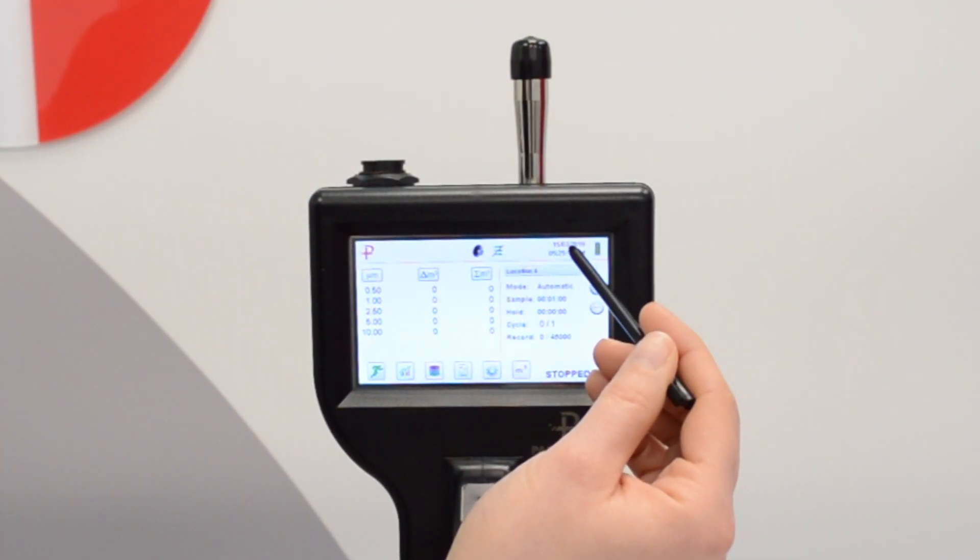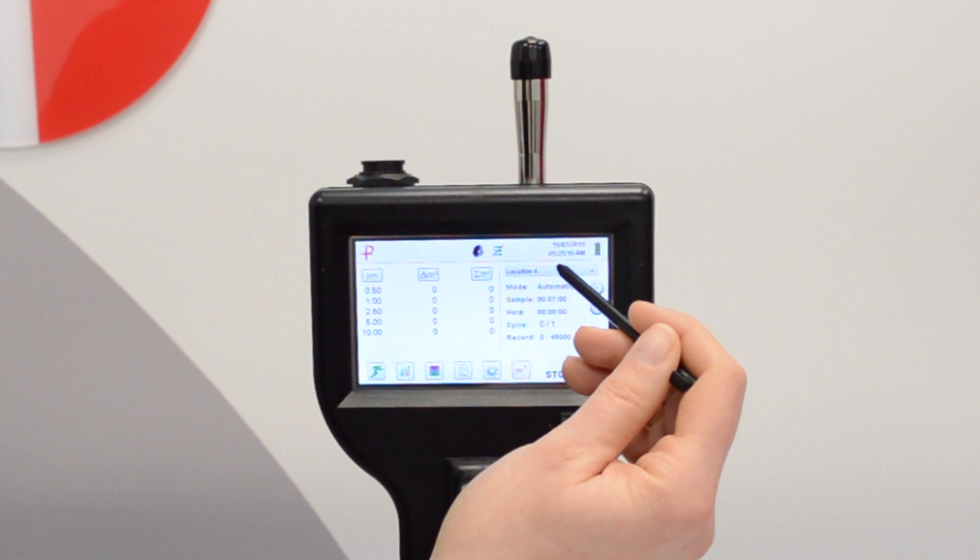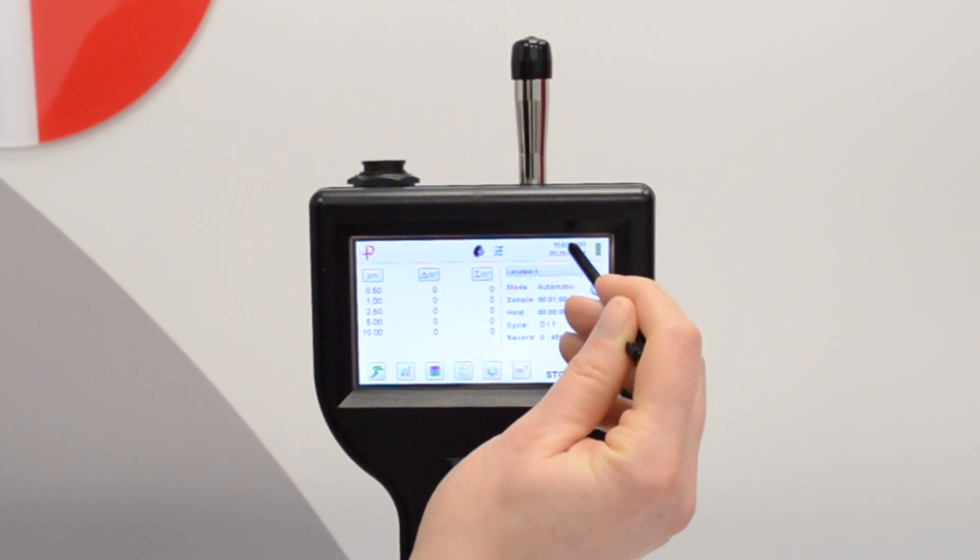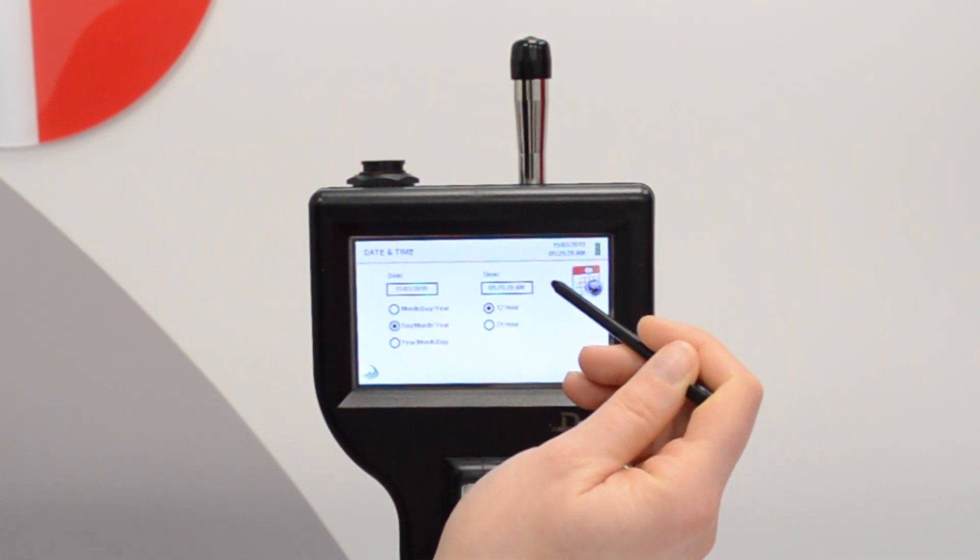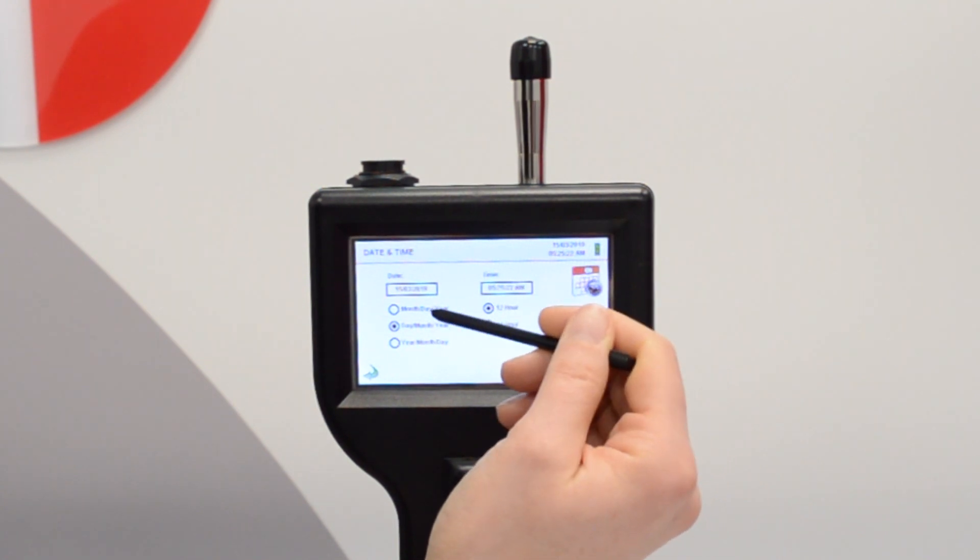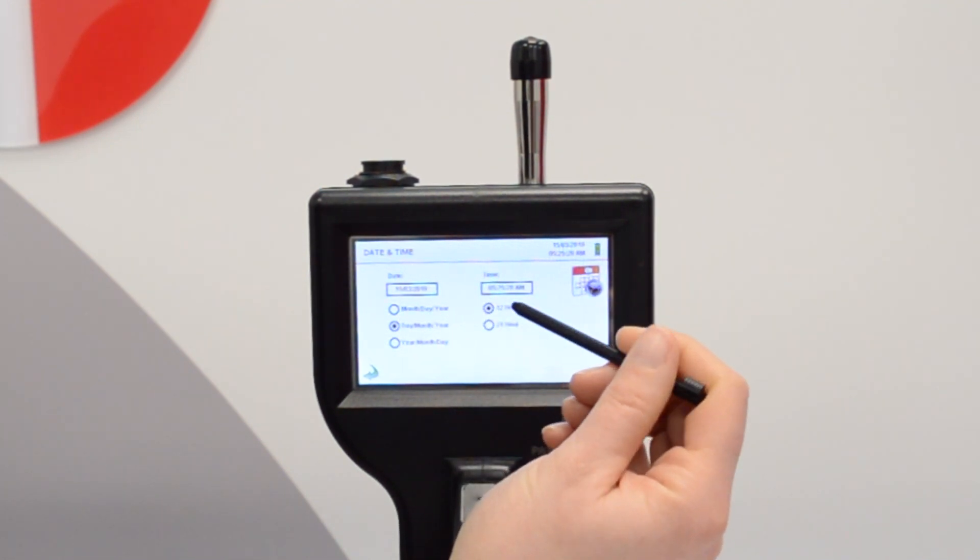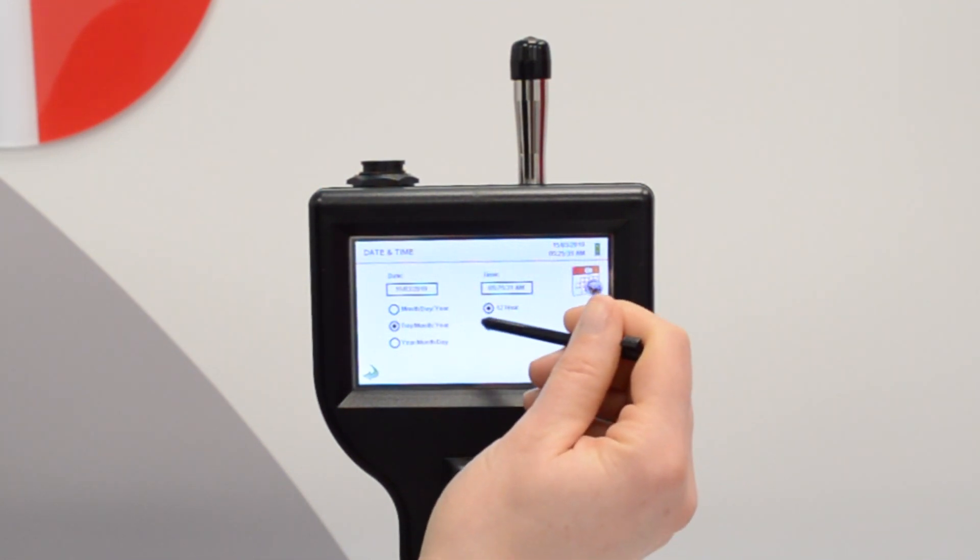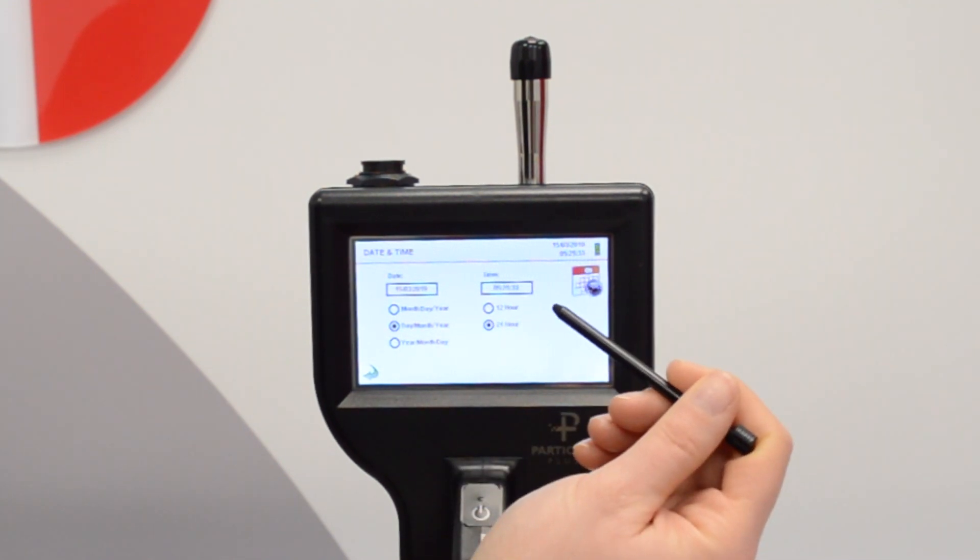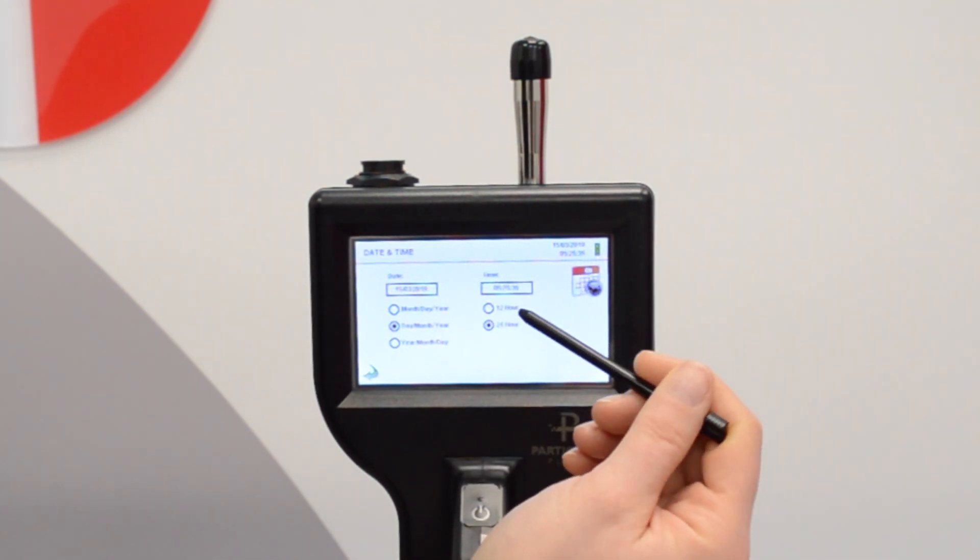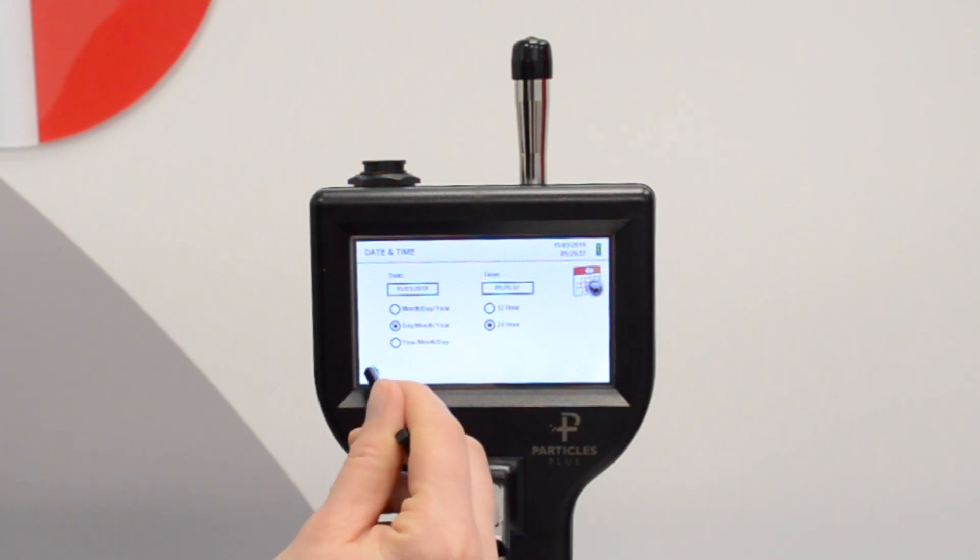Importantly you need to set your date and time. This will mean that the time and date stamp will be correct on any readings you take. Just tap on the date and time field and you are taken to the setup screen. You can change the date format to whichever one feels most intuitive to you. Likewise you can select the time field to be displayed in a 12 hour or 24 hour format. Once you've made the selections you need, click back to return to the home screen.